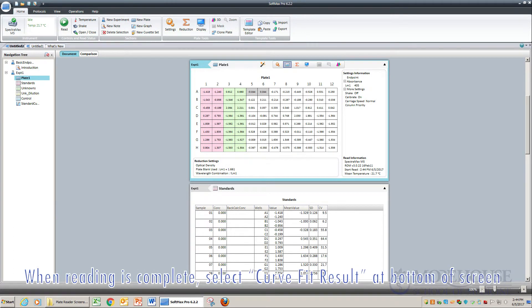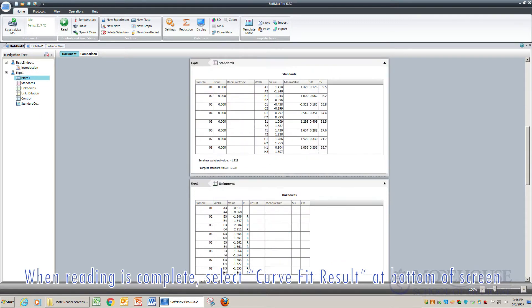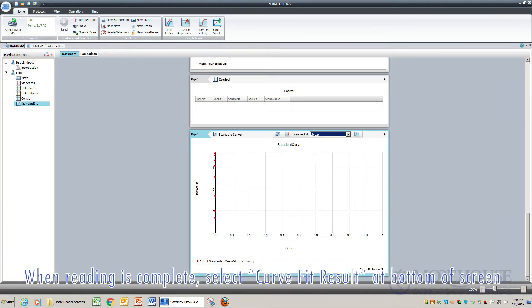When the reading is complete, select Curve Fit Result, located at the bottom of the screen, to see the standard curve.